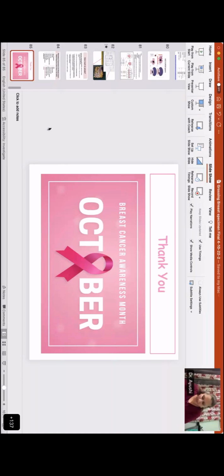It's not just Tata, ma'am. When I was studying in AIIMS as a JR, that is a practice. Yes, but I've never seen it done anywhere else in the world. So we learned it the hard way, that if we put the specimen back into the containers without the cotton, sometimes the slices used to stick together and the formalin would not penetrate properly in those areas. Whether it's soaked or dry, obviously is of no significance at all.